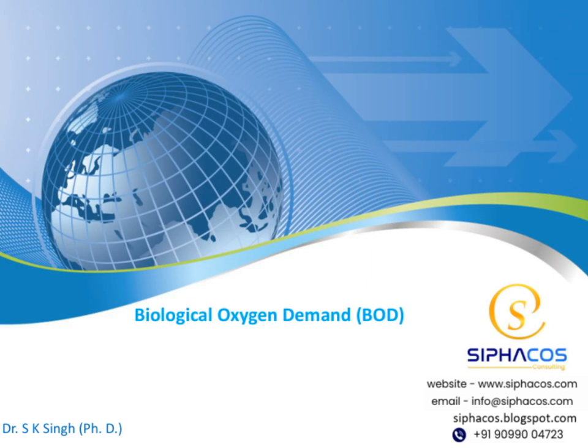I'm Dr. S.K. Singh, and I'm excited to talk to you about biological oxygen demand, or BOD. In this session, we'll explore what BOD is, why it's important, and how it's measured. Over the next few slides, I'll guide you through the key concepts and applications of this vital environmental parameter.